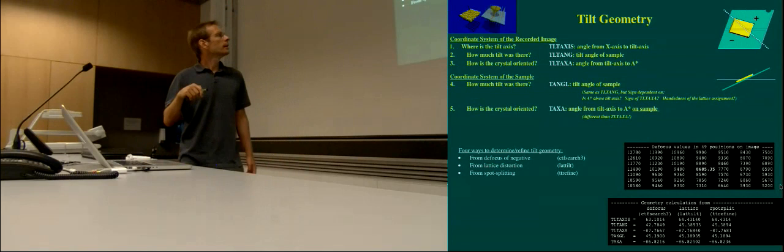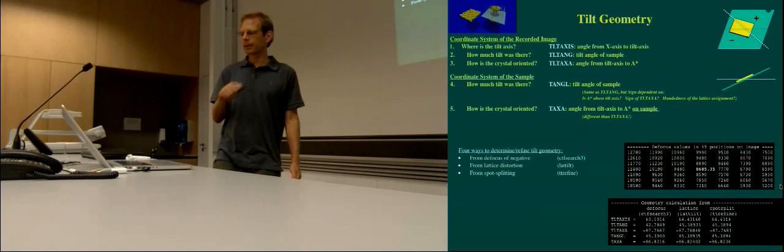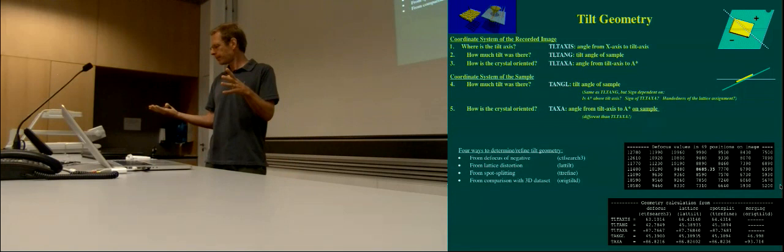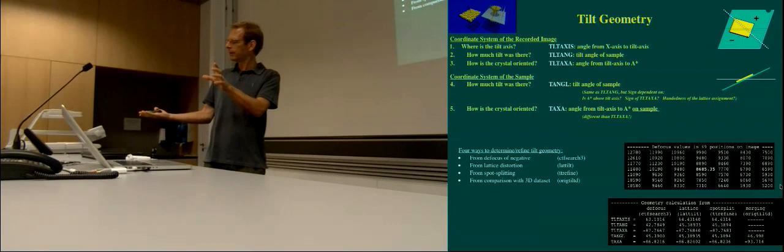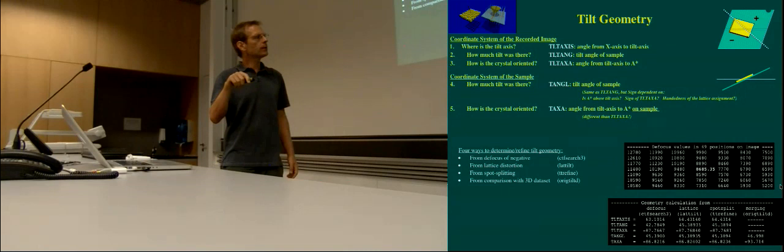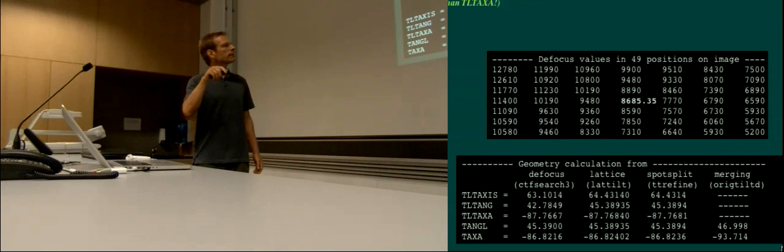The third way is by fitting spot splitting in your Fourier transformation of highly tilted images. MRC programs TT Refine, for example, do that. The last way to refine the tilt geometry is during merging. If you have a 3D reconstruction of your protein and you have a map, you can compare the map with your 3D reconstruction and say: this map looks like top left. The program Auric Tilt can do that — it can refine the tilt geometry by comparing your picture with your 3D reconstruction.